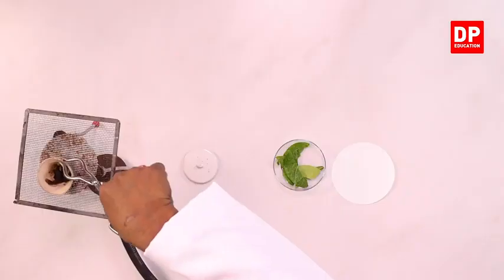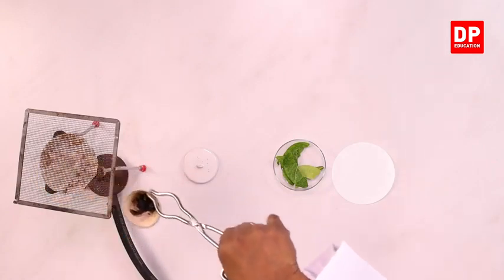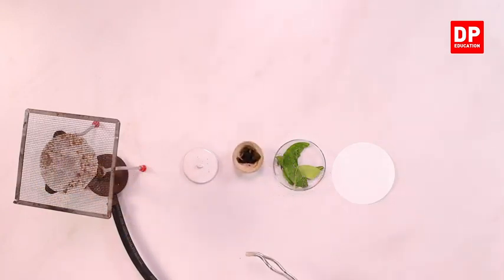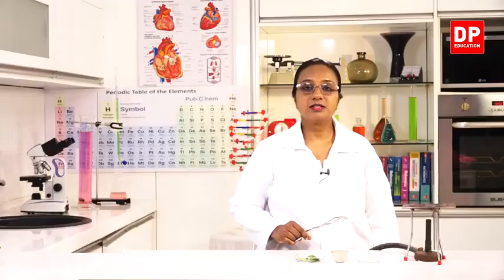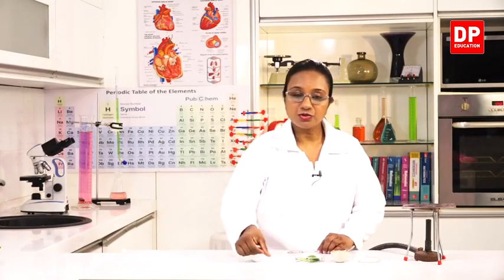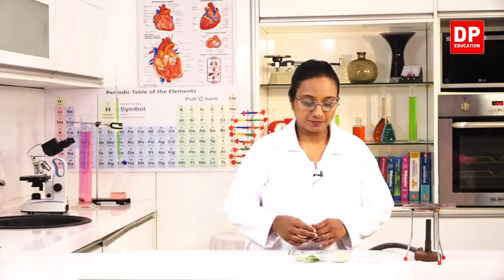Then I will have to remove the crucible from the burner. You will have to leave it for some time because it will be very hot, and after that, once it cools down, we can take out a small piece of the black color residue, and then I will try to draw lines on this white filter paper.